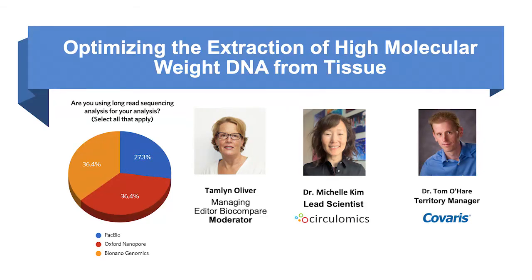All right, it looks like we have 27% using PacBio, 36% using Oxford Nanopore, and 36% using Bionanogenomics. Does that make sense, Michelle? Is that what you're seeing as well, pretty much?